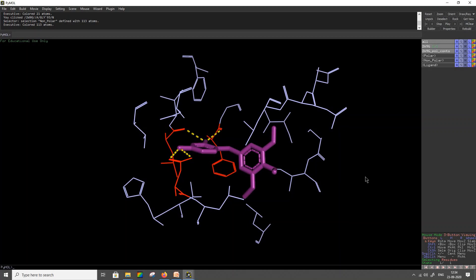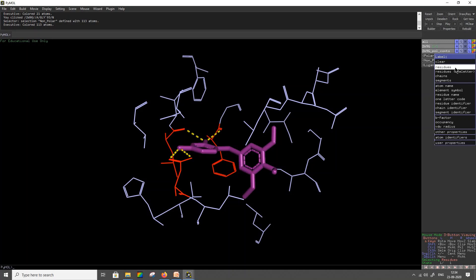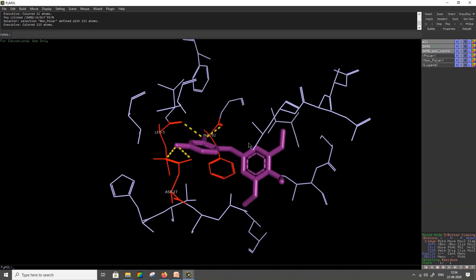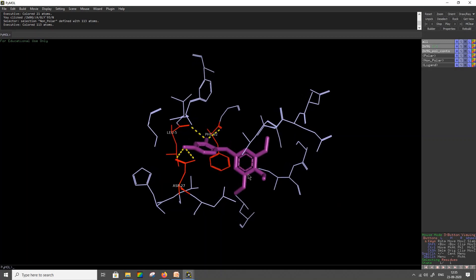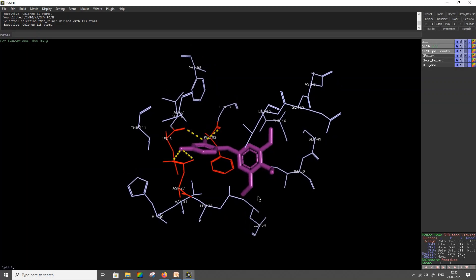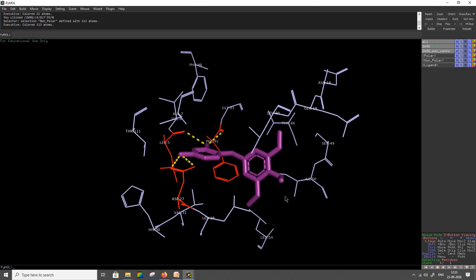Further to increase the annotation, go to the Polar section, click on L for Label, then Residues. Now you will be able to identify all the residues involved in polar interactions. For example, leucine 5, phenylalanine 92, and aspartic acid 27 are the amino acids forming polar interactions with the ligand, whereas all the other amino acids are forming non-polar interactions. If you want to label the others, go to Non-Polar, click on L, Label, then Residues, and you will see all the residues forming non-polar interactions with the ligand.